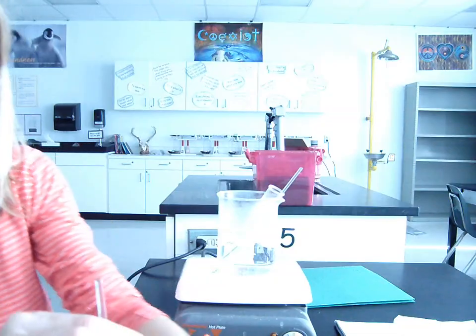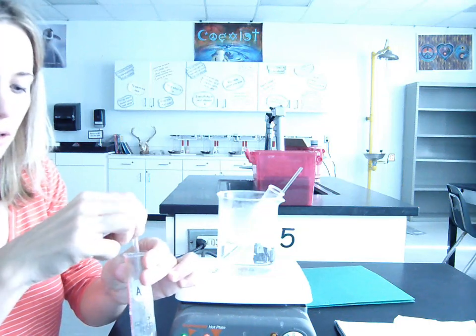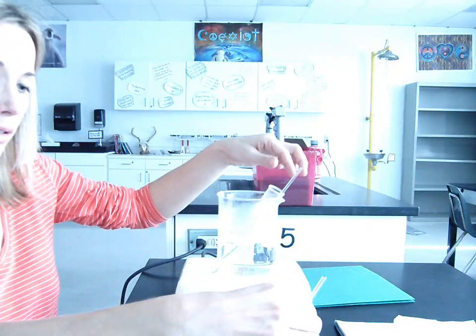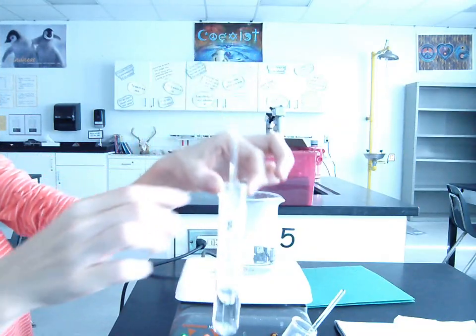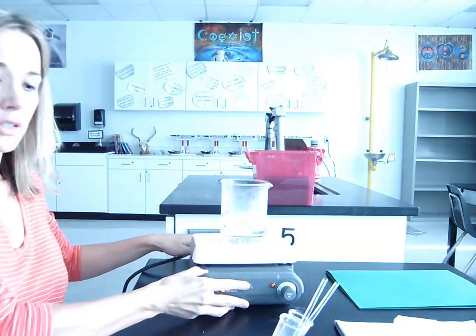So if you look at your data sheet, you made some observations at room temperature. Now you have some observations for when we heat it. Substance A does not appear to be affected by the temperature. Substance B becomes more soluble in water as you heat it. Now, the third part, we're going to bring this back down to room temperature again. And we're going to make some observations.